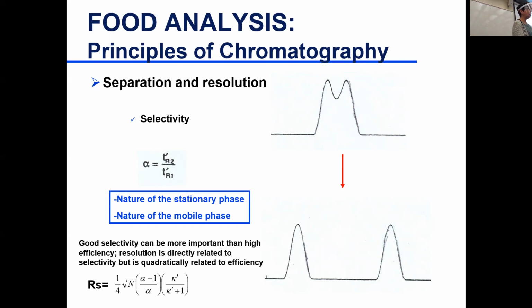It's organic strong, it's not polar. So if you're using that and you have compounds like this, two compounds very close in characteristics, when you increase the acetonitrile concentration, they're going to come out not separated. If you want to enhance separation, and you know that you're running isocratic, that means your solvent has the same concentration, because if it's gradient, they're going to co-elute even more. So the solution is not going from isocratic to gradient. You're already running isocratic here.